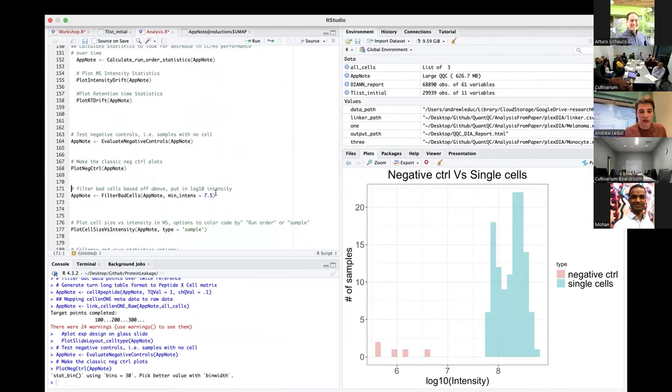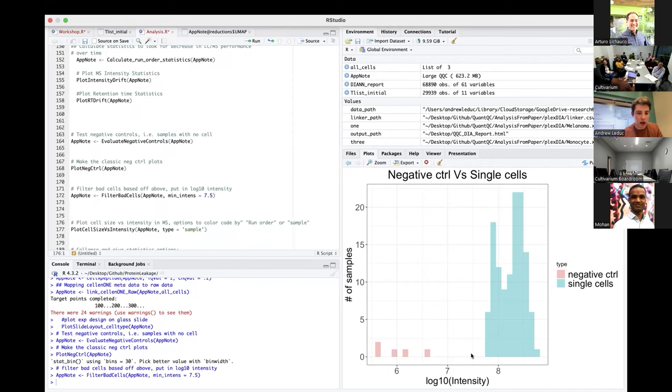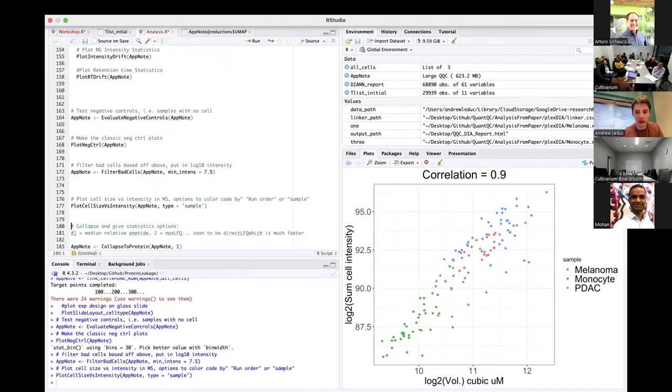And then I can filter at some minimum intensity threshold. Maybe I pick 7. Say there were some single cells down here that didn't look so good, I would maybe want to filter them out. But I'll just choose 7.5 here because it looks like a good way to divide the negative controls from the cells. Again, we can plot this. Saw before, looks nice.